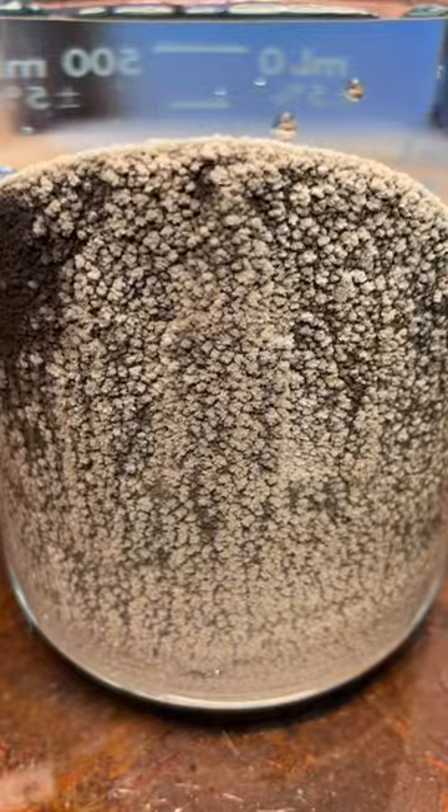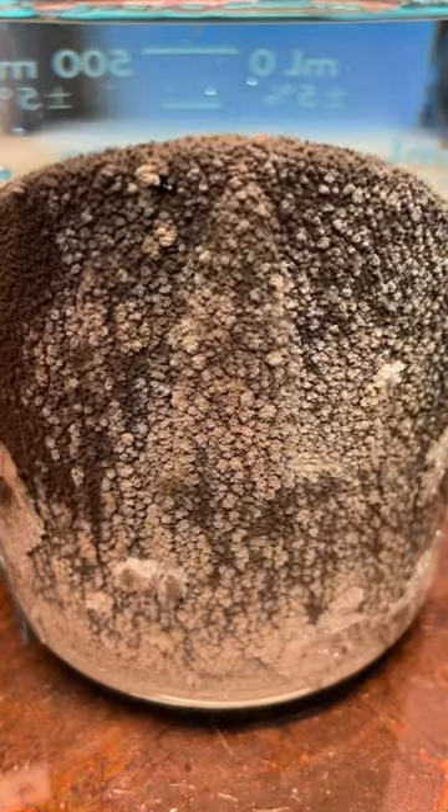I'll transfer the solution to a suitable container, add the copper and fast forward through about 5 minutes of silver recovery before shaking it off and fast forwarding through another 5. Nice.